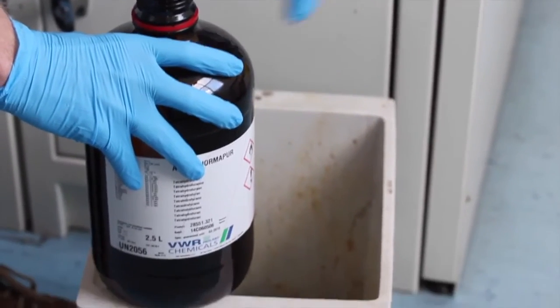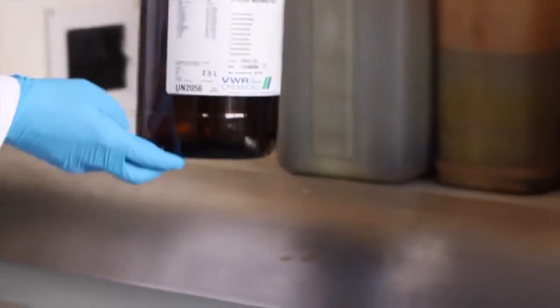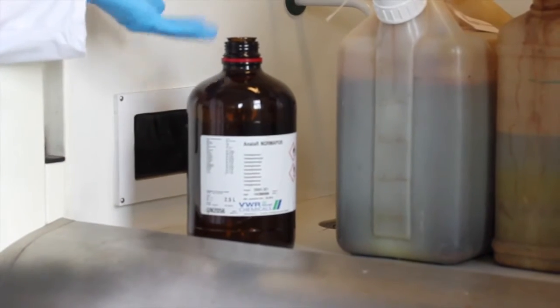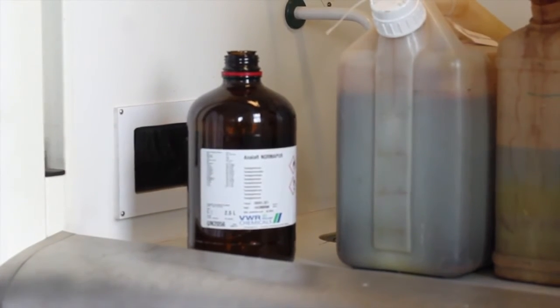If the bottle contained a hazardous reagent, you must rinse it with an appropriate solvent first and dispose of the hazardous liquid waste properly. Then you can leave the bottle under the fume hood for at least 1 hour before throwing it into the broken glassware bin.